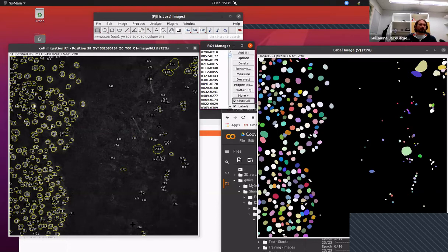And the reason for that, and that's what I was also highlighting in the talk, is that basically the images that I have are a little bit noisy, and they are different enough from the training data set that has been used to train that model, so that even though it's very similar and almost usable, it's not quite usable. And it's a perfect example of where transfer learning can really help you.